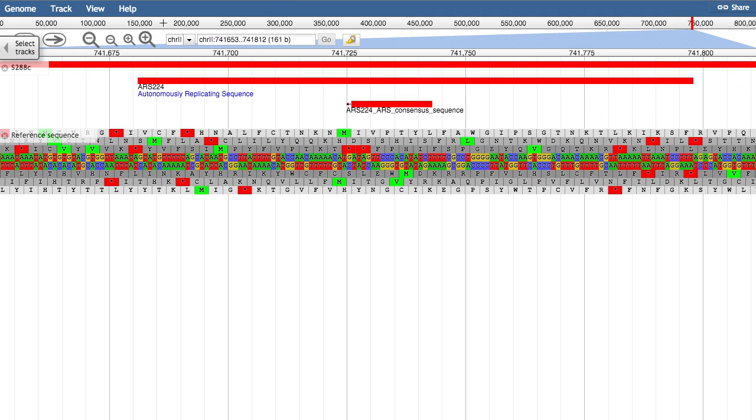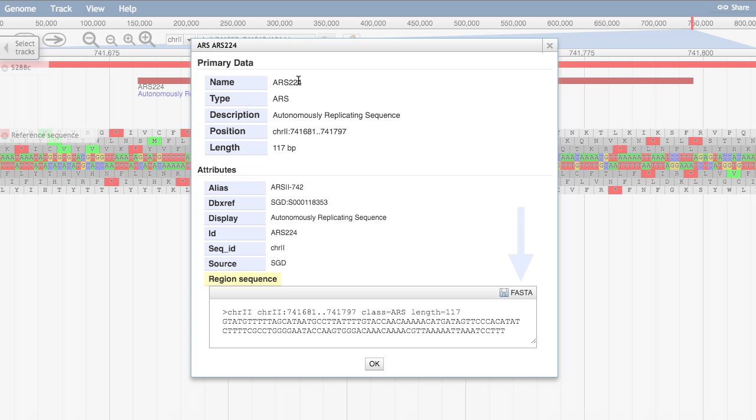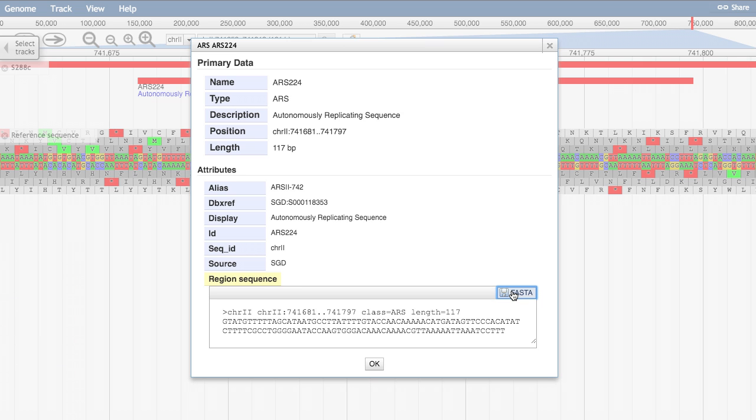The second way to download a sequence is to simply click on an ORF or Chromosomal feature, and click on the FASTA Save button in the Region Sequence section. This will save the sequence of whatever feature you have selected as a FASTA file.